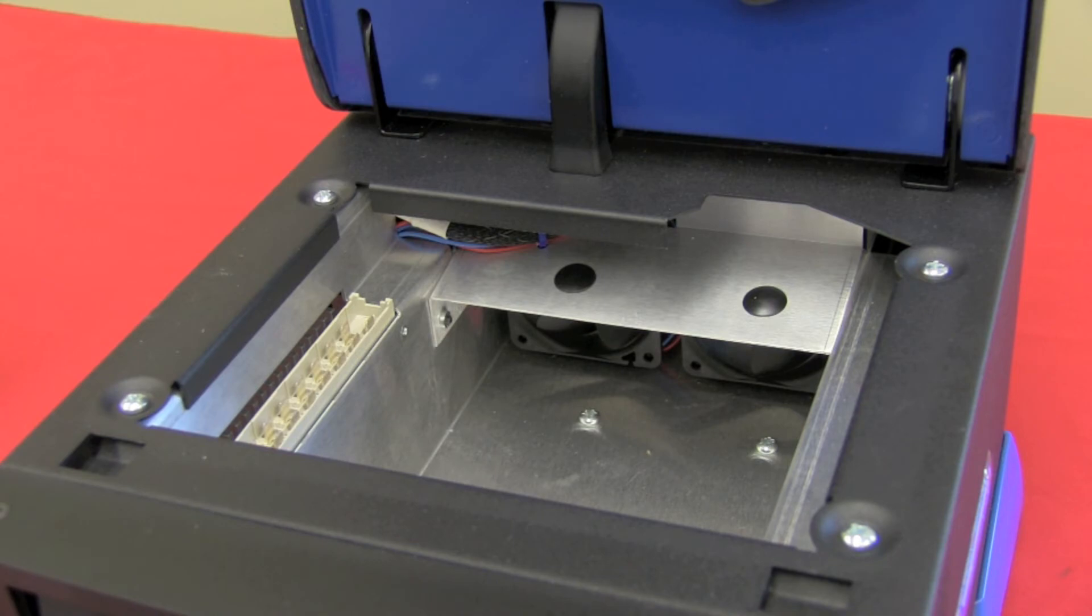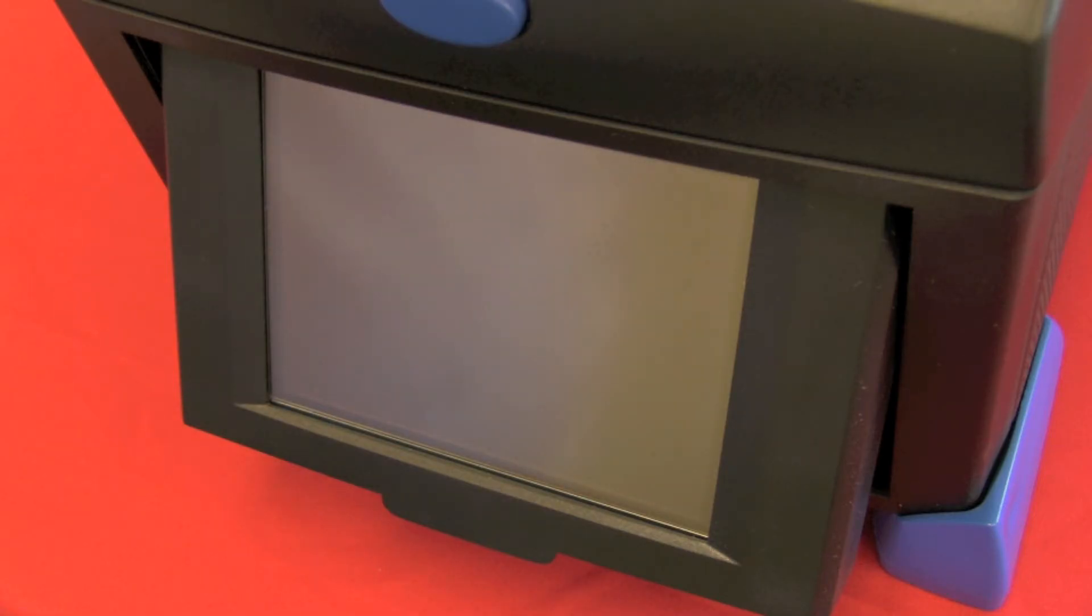When you first power on the Series 6, it runs through a set of diagnostics just to check that everything is okay. You'll notice that there is actually a color display on this unit. The Series 4 doesn't have a color interface. Although it is touch screen, it doesn't have the benefit of color in its display. You can see you're ready to go right from here.